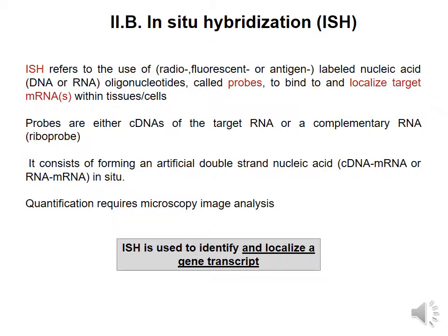And this quantification requires microscopy image analysis. This technique is mostly used to identify and localize a gene transcript, but it can also be used to quantify levels of that particular transcript.